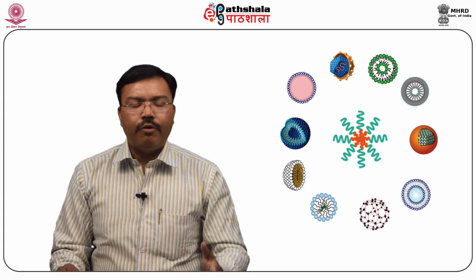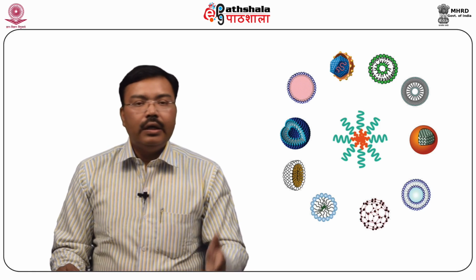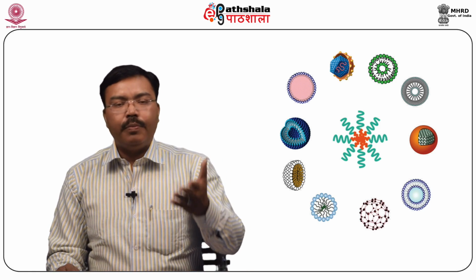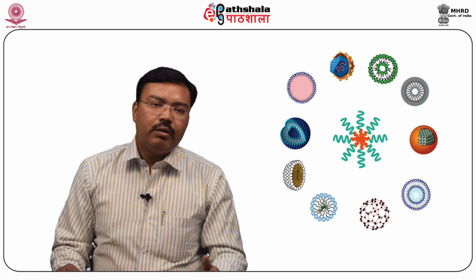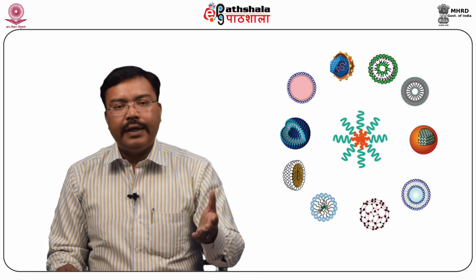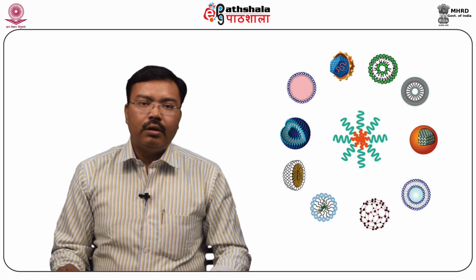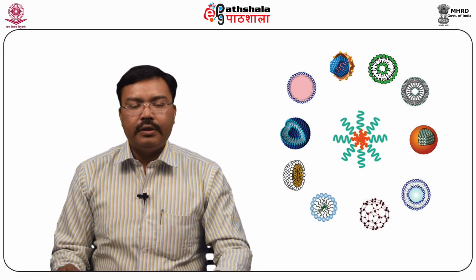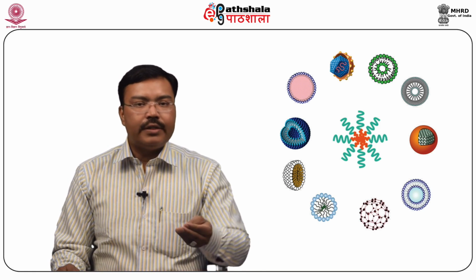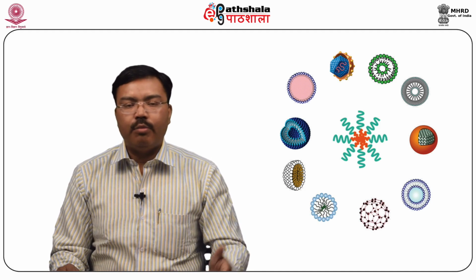Another method for thermodynamic stability is the centrifugation method. In the centrifugation method, we prepare a 1:100 dilution of reconstituted microemulsion, and then it is subjected to centrifugation at around 6000 RPM for 30 minutes and observed for any phase separation or phase clarity. It can be observed visually.